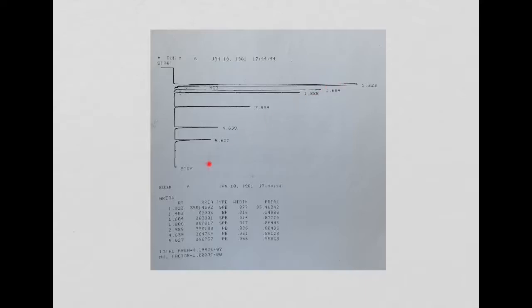When you look at this, do you see these guys over here? Yeah? These are the retention times. Okay? Those are the retention times. So these are my retention time. I'm going to underline it. Okay? Now, one thing that we can do, you could come over here, and RT is for retention time.